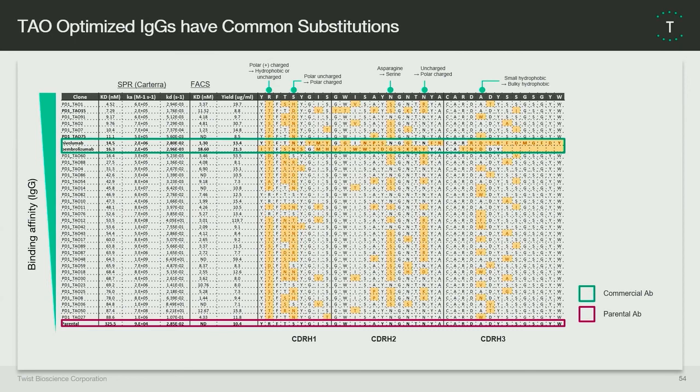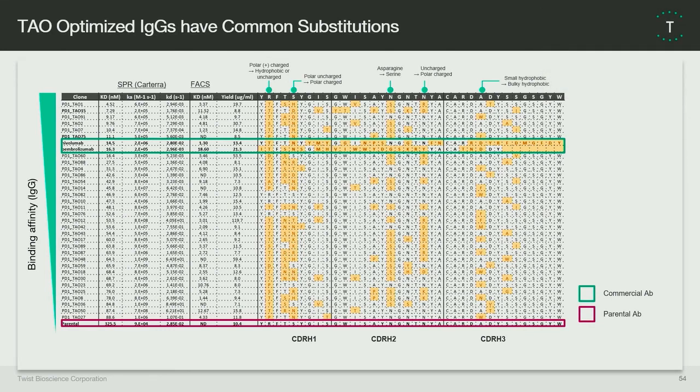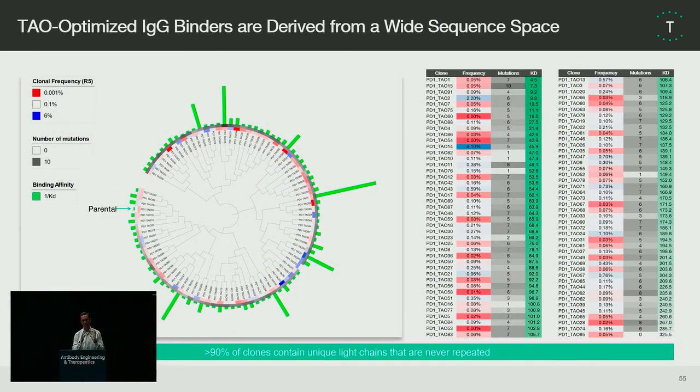Another thing is when we build the libraries, we also fold in a lot of additional single amino acid mutations into heavy chain CDR3 as we build it. Initially, it was actually very difficult to find sequences within a defined mutational space for CDR3 because of the huge breadth of sequences in that particular region. As we've increased the number of sequences in our databases, we're able to make some matches based on similarity. But to add in additional mutants into our library, we also incorporate a single amino acid scan as we build the library.